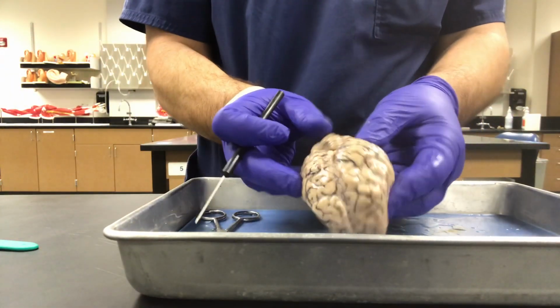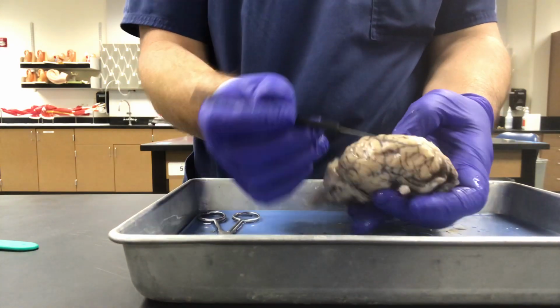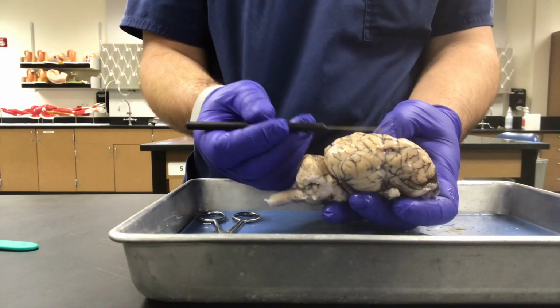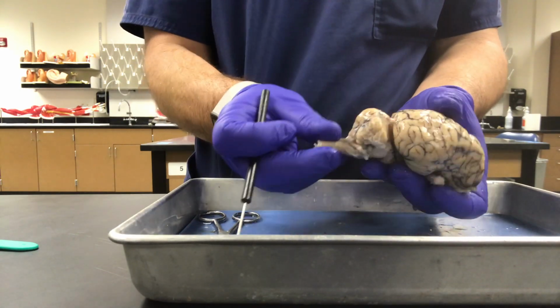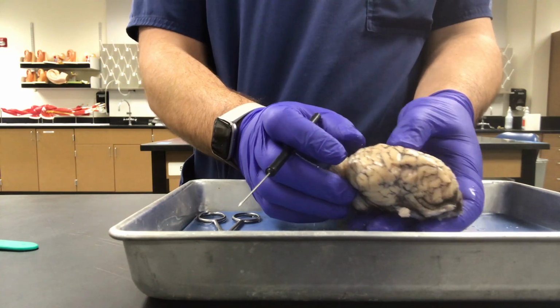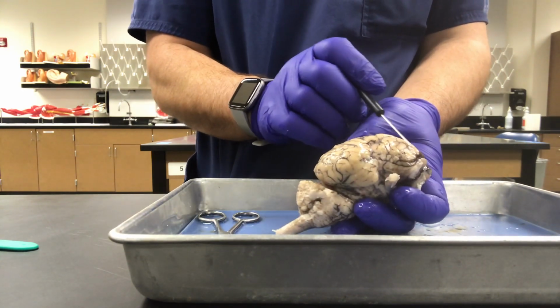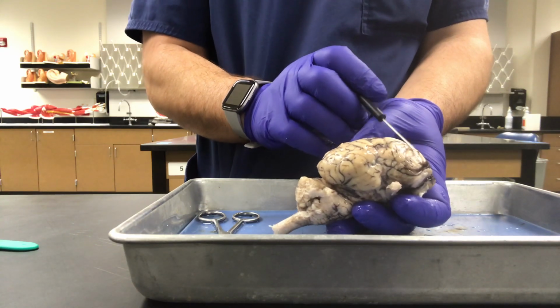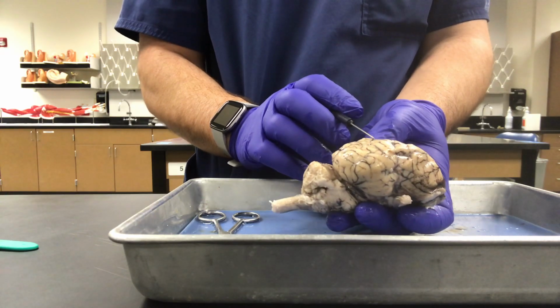Okay, so here we have a sheep brain. This is going to be the front of the brain in this area, posterior aspect of the brain, so anterior, posterior, the top and bottom. We got something coming off the back end called spinal cord. So parts of the brain I want you to be able to identify. In this anterior portion that you see right here, this is going to be called the frontal lobe. Frontal lobe.